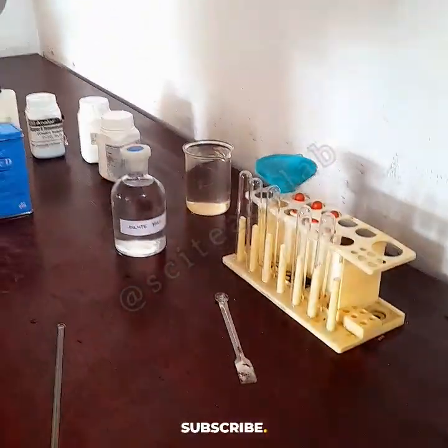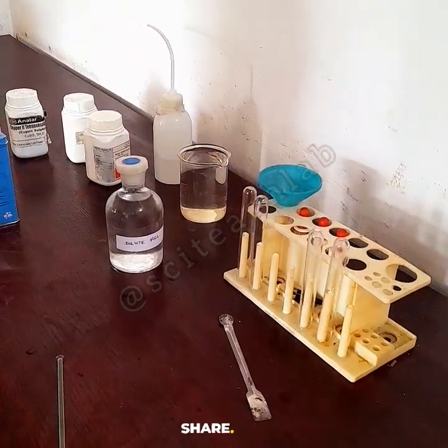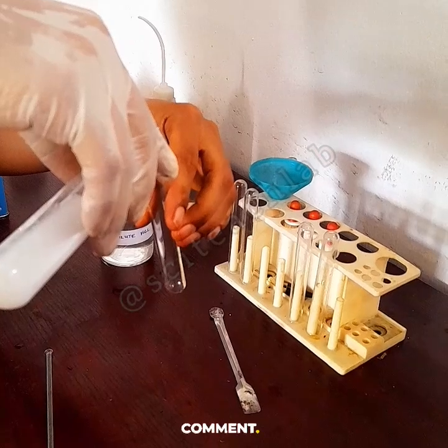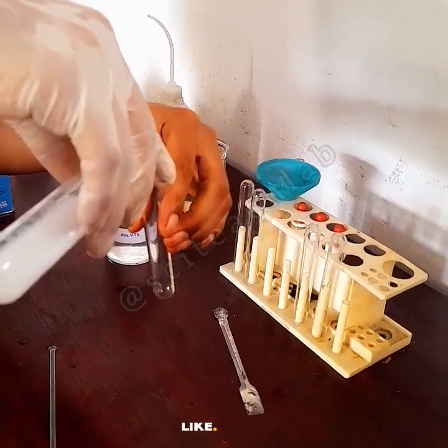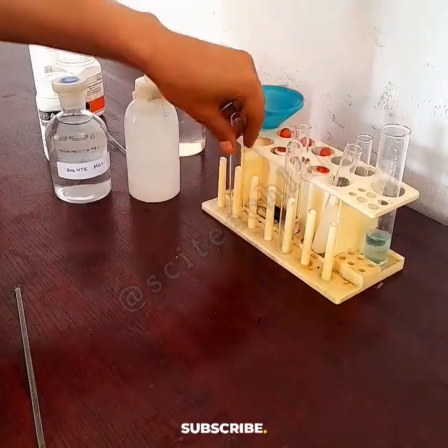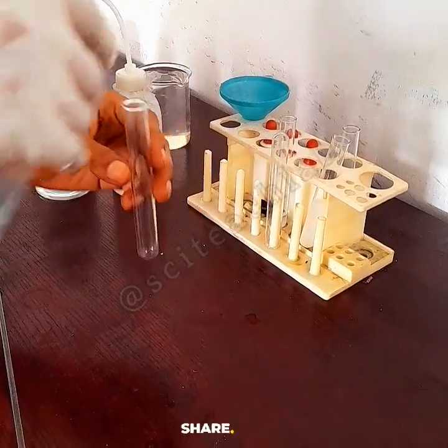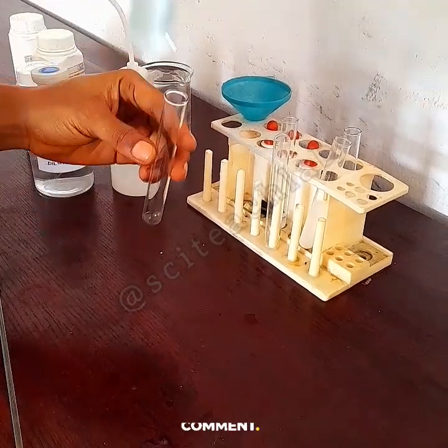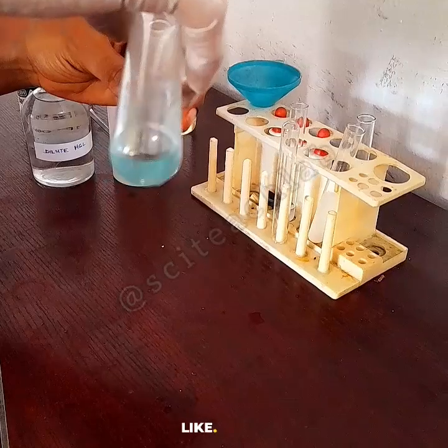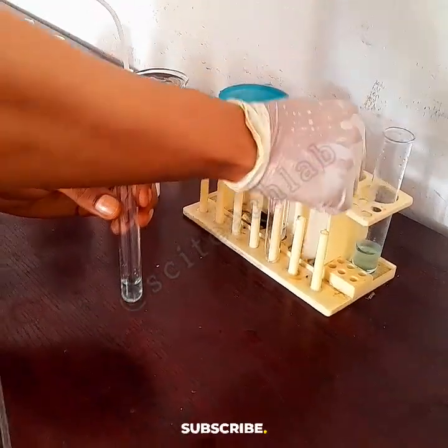I'm going to use it with that same solution of C. So I get another test tube and put a little amount of that C solution that we dissolved from the beginning in it.